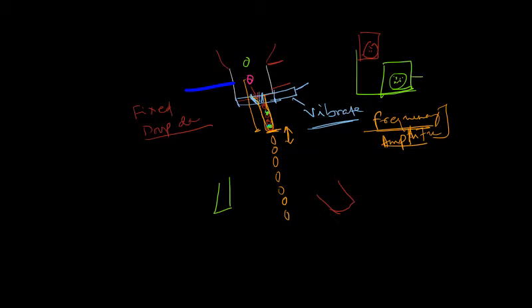So here I give a command to the instrument: sort gate 1 to left, and sort gate 2 to right. This is the command I am giving, and we have the drop breakup point stabilized and fixed. Then when we give a short command to the instrument, the moment it detects a cell falling into a desired region, it waits for the cell to travel to the edge of the stream.